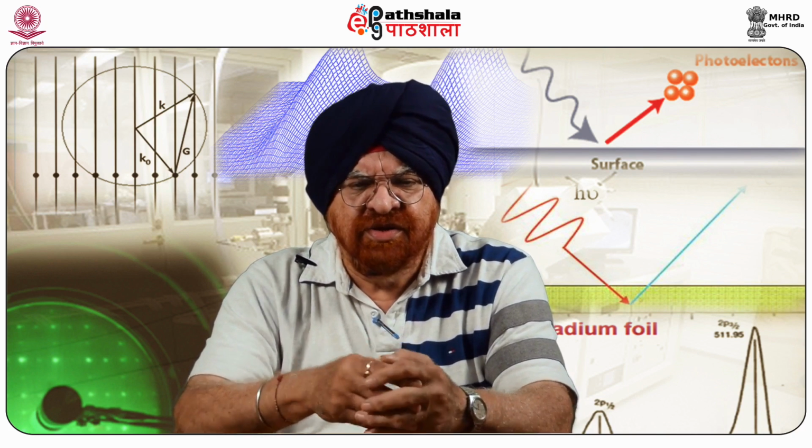Today we are going to discuss the module called electron spectroscopy for chemical analysis. It is abbreviated as ESCA, and this comes under the paper Surface Analytical Techniques Part 1.